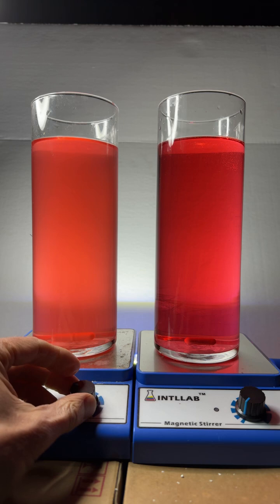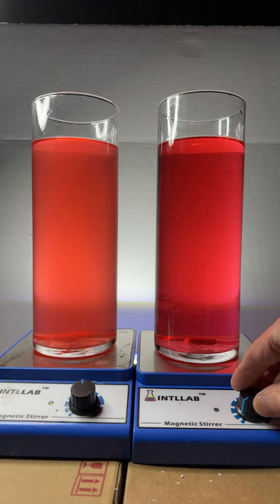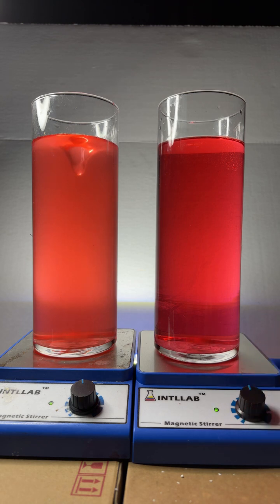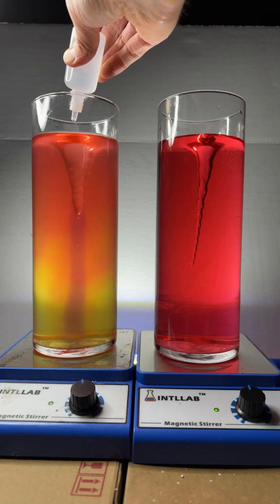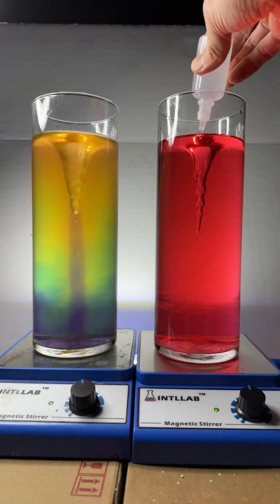Hey, look at this — hello YouTube! We're live with Tommy Technetium. I've got some rainbow indicators here. I'm going to add a little bit of base to some of these indicators, a little bit over here on the left. Look at that blue color develop — there it is! A little bit of a rainbow going on, same over here on the right.